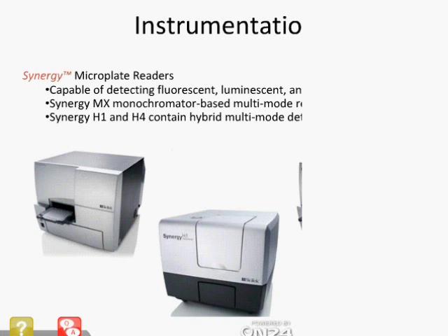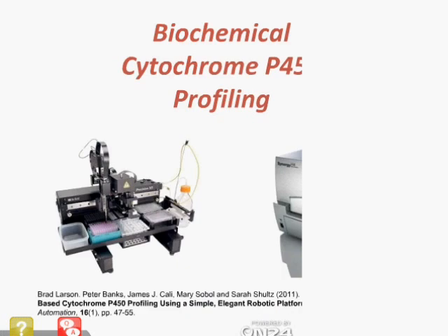So I'm going to switch gears now, and I'll start talking about how we have combined the various cell and enzyme models, assay chemistries, and instrumentation. The first case study looks at the ability to profile various compounds against multiple recombinant CYP enzymes in a biochemical format.